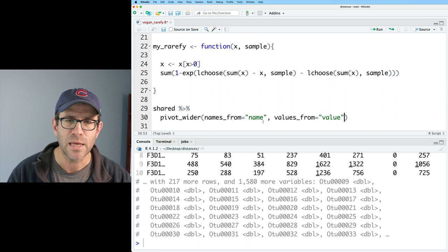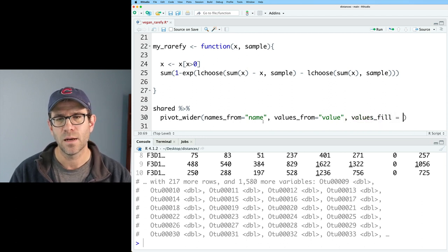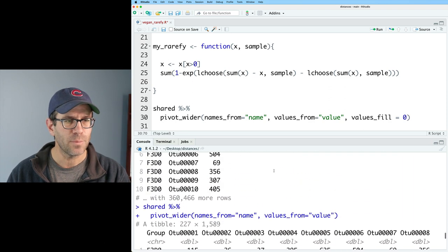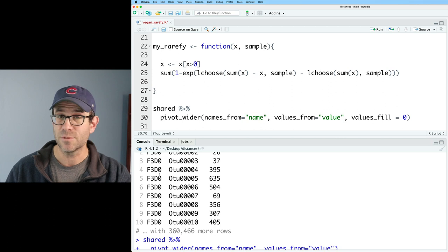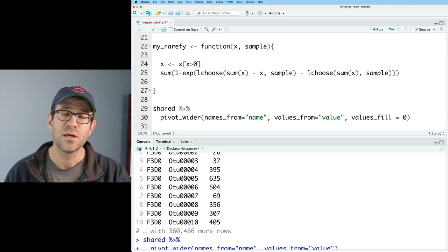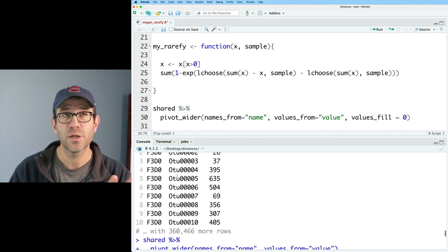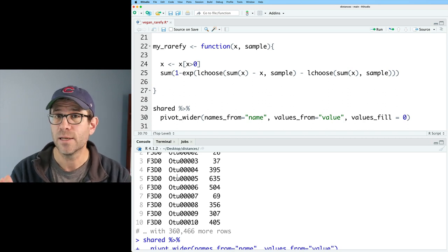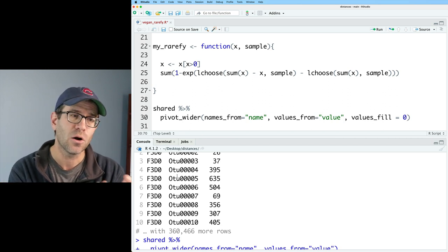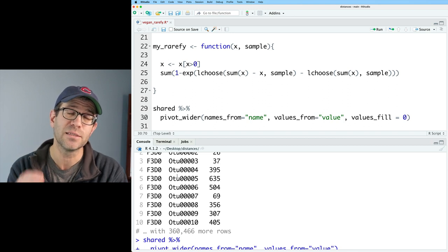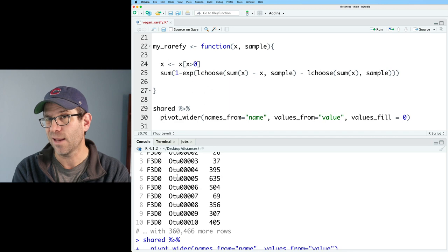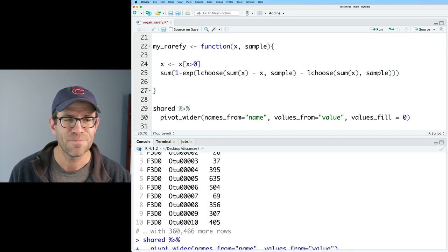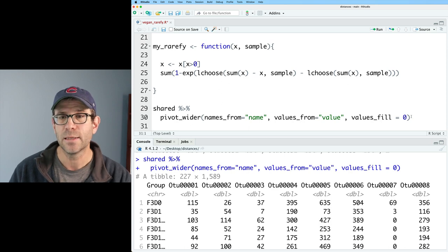Something else I want to add in here is to say values_fill, and I'll say equals zero. So what's happening again, if we look back up at our shared file, that the samples, this first column is the group, those will be in the rows, our OTUs, our taxa, those will be in the columns. And so you can imagine that as you pivot wider, there might be row column combinations, sample OTU or taxa combinations that aren't in the tidy version. And so what pivot_wider does is it puts in an NA value by default. So what I'm saying is instead of putting in an NA value, please put a zero in.